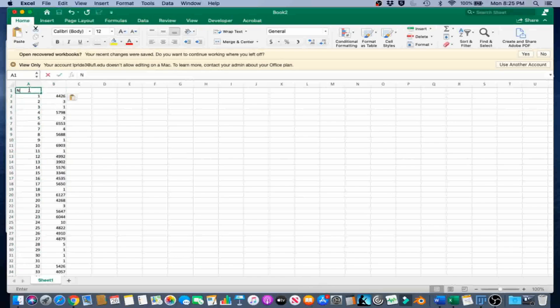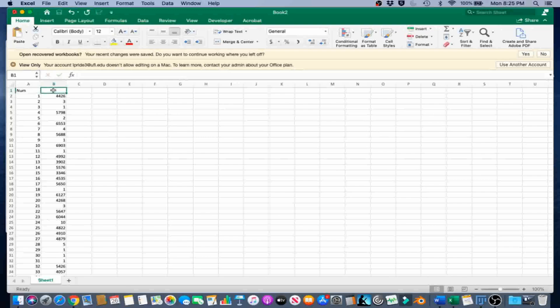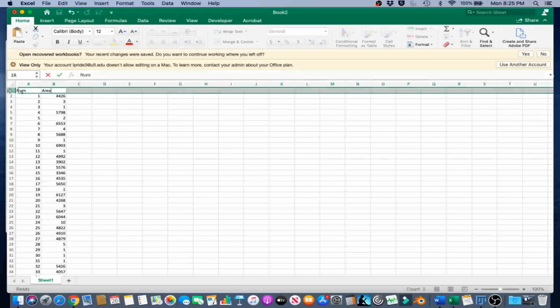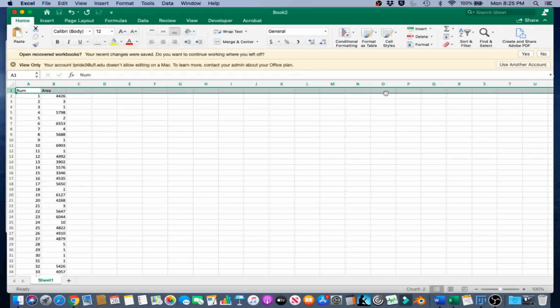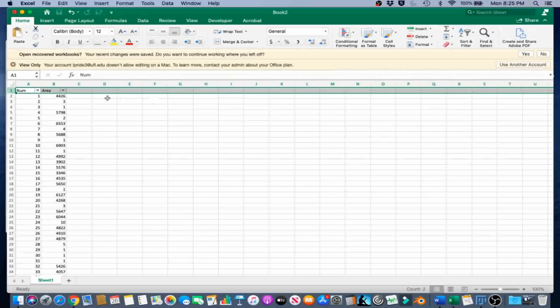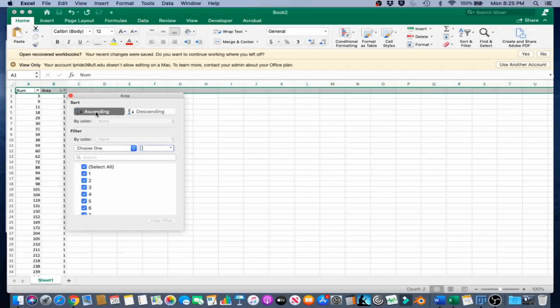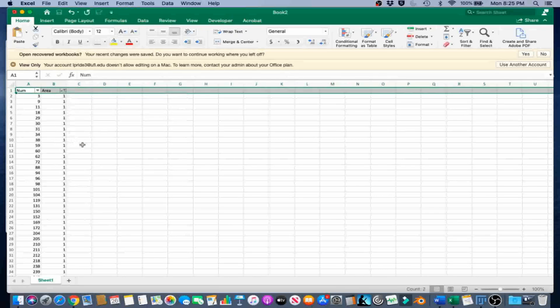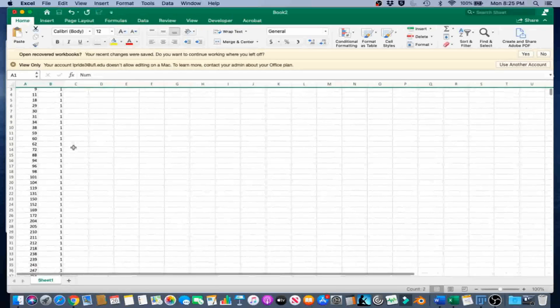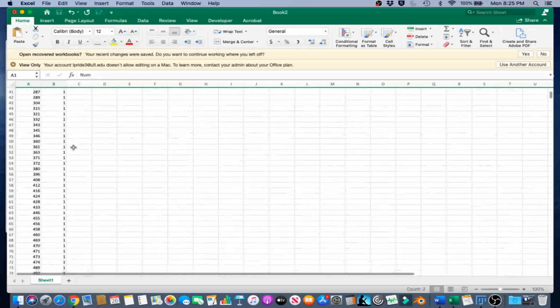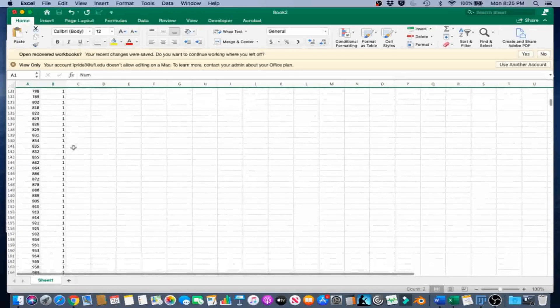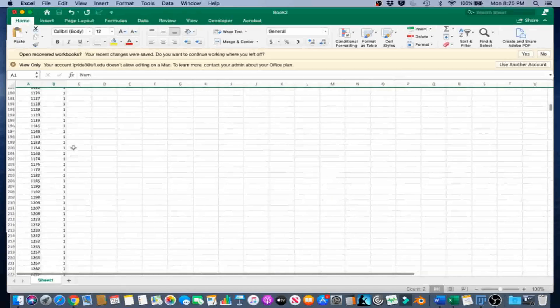I'm going to call this column Num and this one Area. In the Home tab under Sort and Filter, select Filter, and with the caret on the right, sort ascending. What we're going to do is look for a section that has a gap in the area.